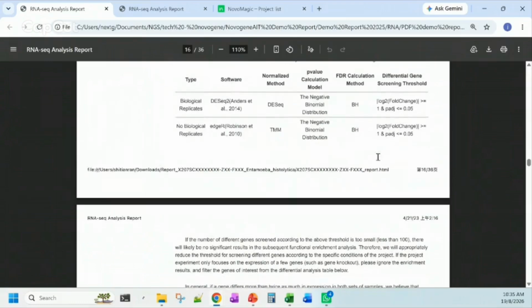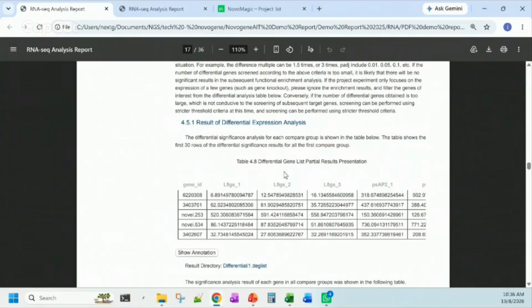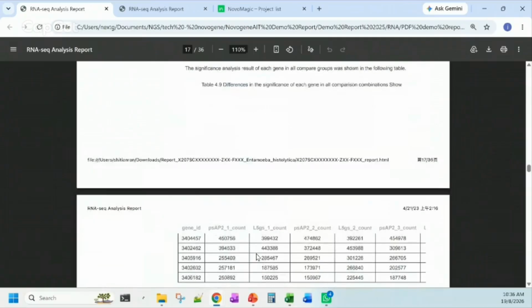By using the default cutoff, the report will summarize how many genes are identified to be upregulated or downregulated. Again, this is only a screenshot showing the first few lines of the full table. Normally the full table is inside the results files provided.